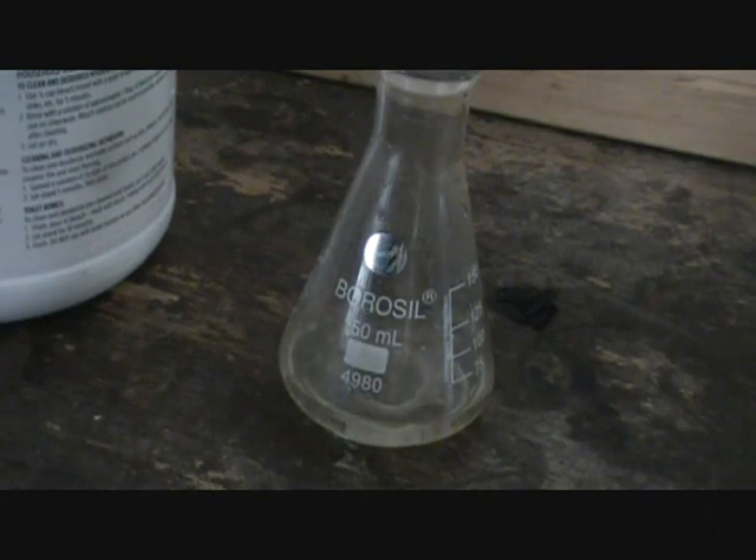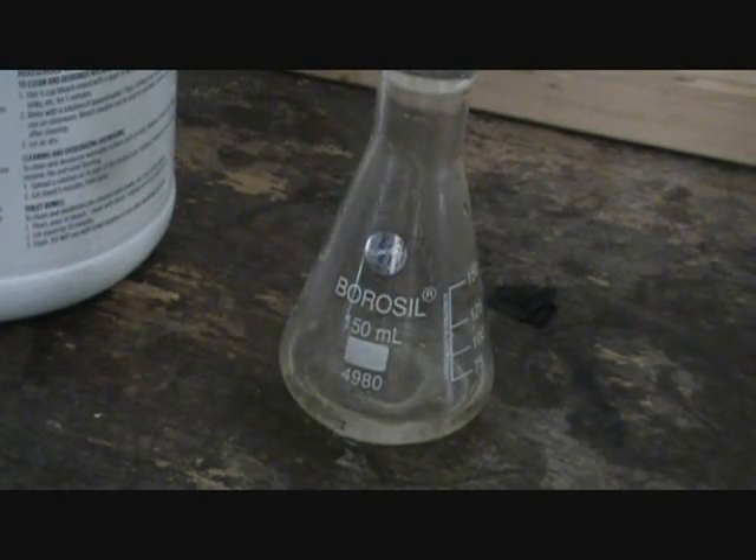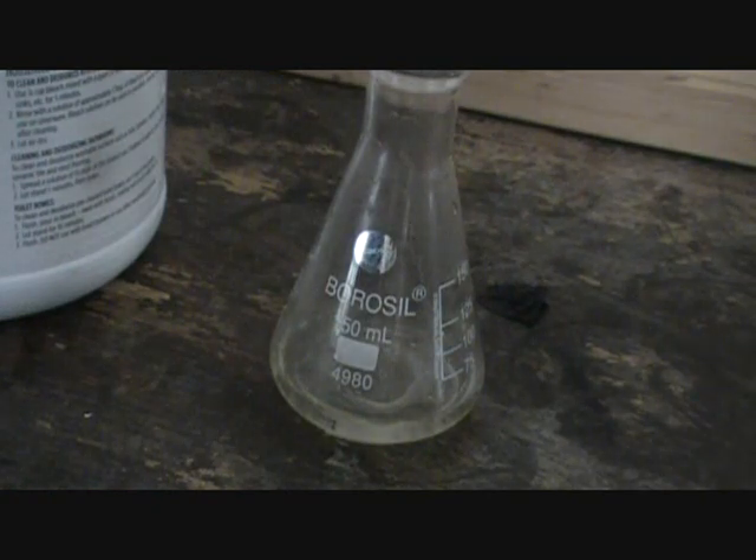I'm going to put it in there. From what I think it's doing, the bleach oxidizes the hydrogen peroxide, which as everybody knows is oxygen.